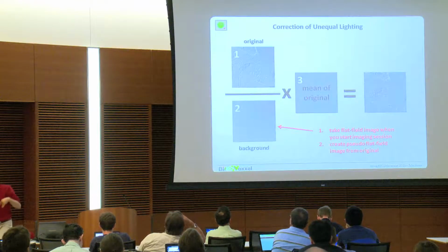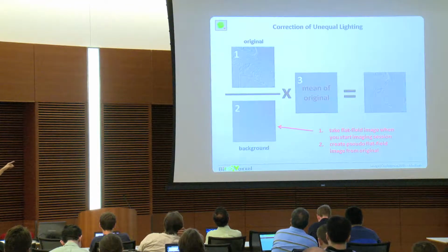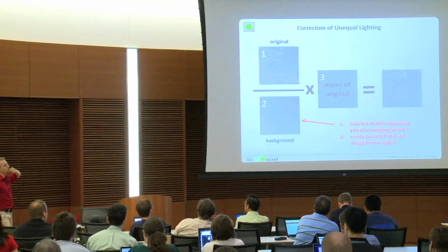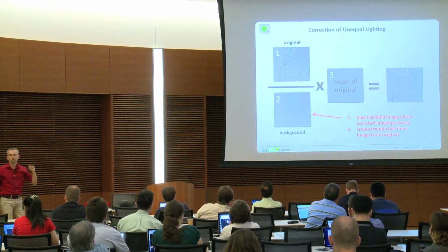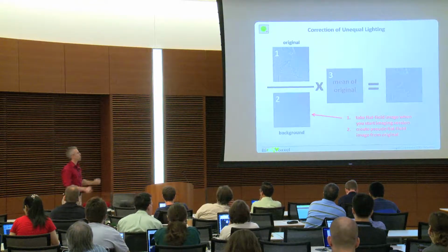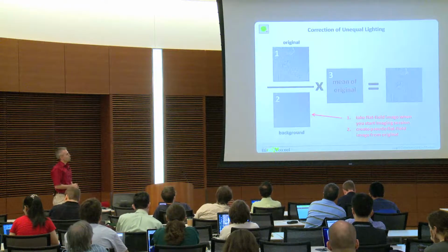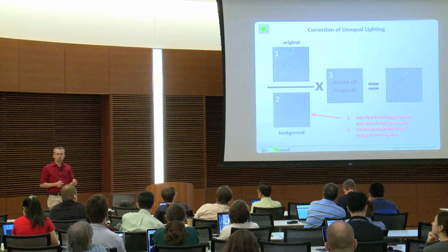If in addition, or especially for those kind of images, when I can try that later on, when you have images like that, so if you have an image which is phase contrast or DIC or anything like that, then the subtract background option is not working. I'll show you that later on, because the problem with that is it creates specifically artifacts, because in such an image you can hardly define any object size. So what we can do there is get either an imaged background.